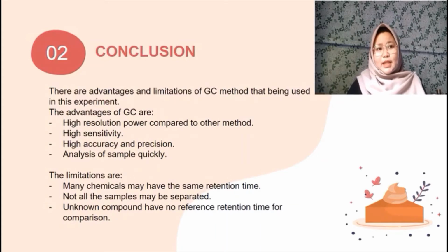For the limitations, many chemicals may have the same retention time. Not all the sample may be separated. Unknown compounds have no reference retention for comparison.